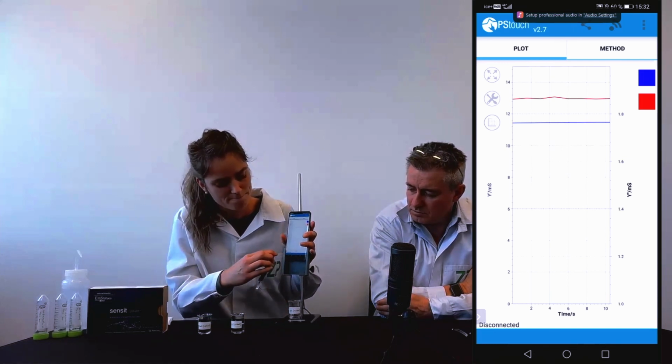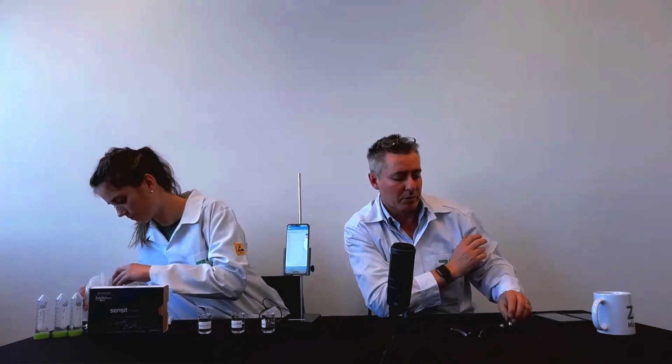Well, thanks very much. It's quite impressive, really, that with such a small instrument, a low-cost screen-printed electrode, a smartphone, you can actually make 3 measurements like that. I don't know how long we've been going for, but 5 to 6 minutes, let's say. No, I'm really, really impressed with that.